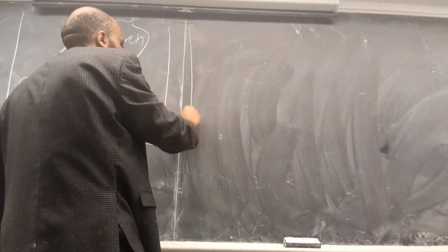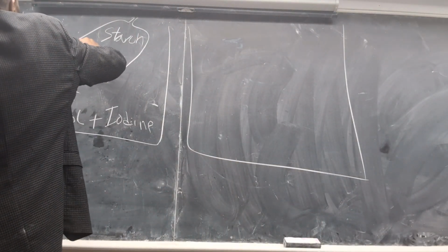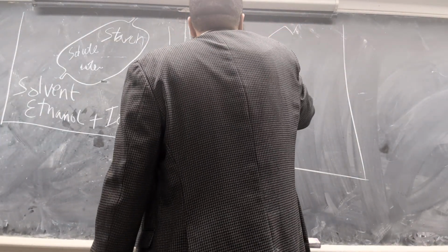In the next experiment, you will have another salt. That is the solute in the dialysis bag. And this is the second dialysis bag.